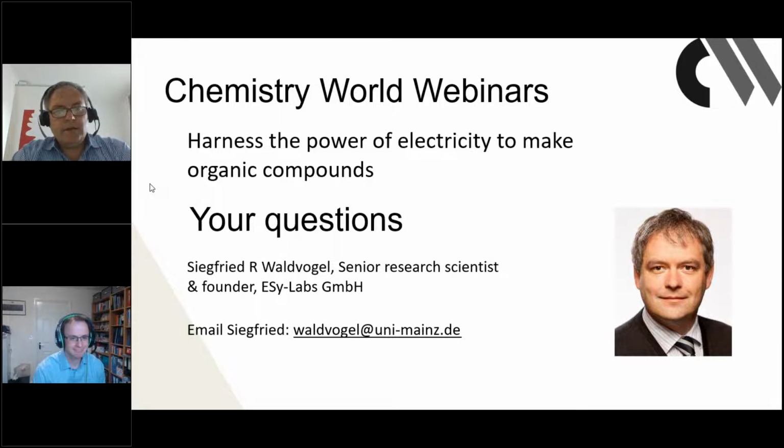Clear answer, no. People try to do that. One big company in Germany, BASF, tested that, and it's not necessary because if you can control the current quite well, the stuff which is first oxidized reaches the electrode. If you go too high with the current, then of course it will be unselective, but in a certain corridor, you're absolutely safe.